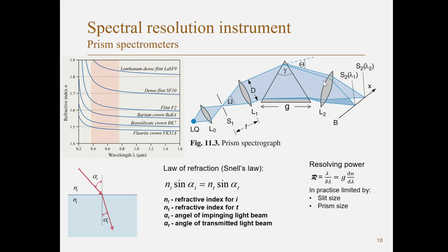Depending on what direction the beam has into the lens, it will be focused to different spots. Over here we then have a detector which can detect the light in all these different spots, like we looked at before, for example a CCD or a CMOS detector. And we will talk more about them.